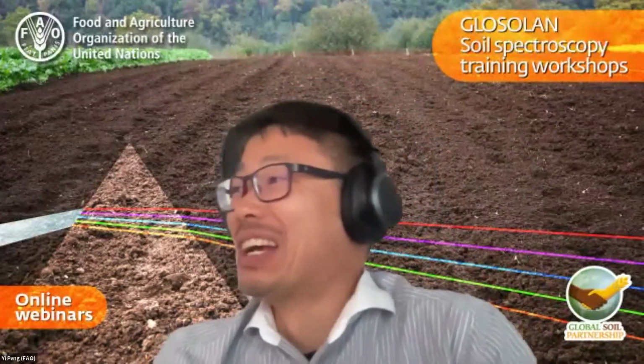Yes, indeed. So the second question is a little bit technical, and it's actually a common question. It's a question where you probably need to write a book to give a comprehensive answer, so it will be a little bit challenging for you to answer in a few sentences. What is the variability of the spectral measurement based on the soil moisture of the soil sample? What is the variability that basically affects the measurement?